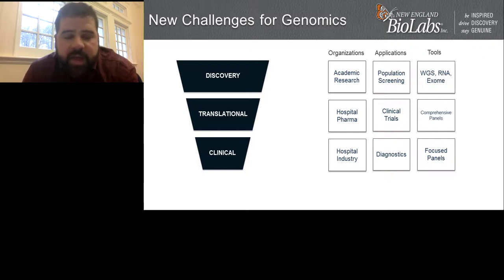And then finally, as we move to the real clinical application of this, we're really talking about hospitals and diagnostic service labs, where we really aim to return information on a patient back to a physician. This is really where we want to narrow in the focus of the type of content that we want to include to just those things that are going to be clinically impactful. So that's where we tend to see that sort of funnel shape coming into play.